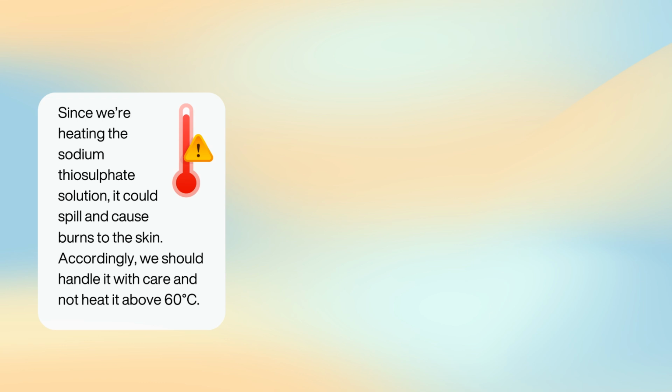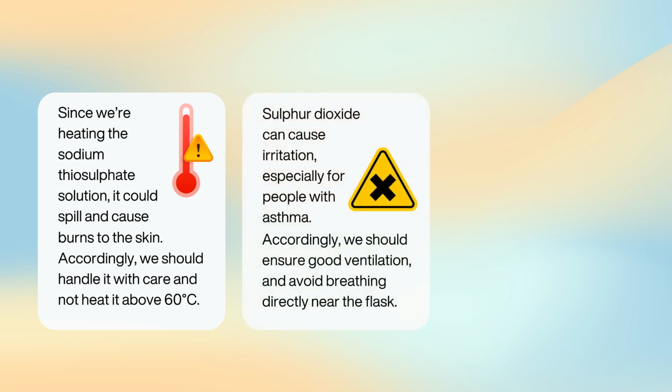Additionally, another product in the reaction is sulfur dioxide. This can cause irritation to the eyes and lung, especially for people with conditions like asthma. Accordingly, we should ensure the room is well ventilated and avoid breathing directly over the top of the flask.